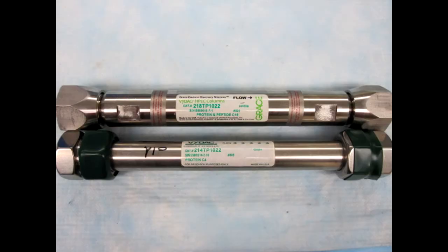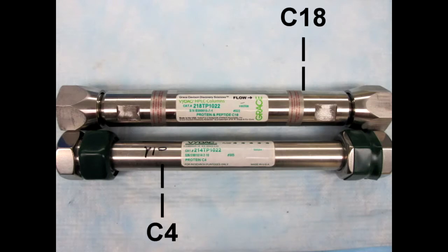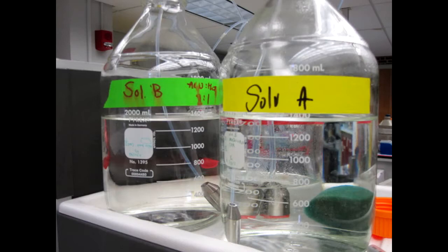For HPLC, our stationary phase includes various hydrophobic C4 and C18 reverse phase columns. We usually use C4 for large proteins and C18 for smaller peptides. For our mobile phase, we utilize the ability to make gradient mixtures of two distinct polar solvents in order to maximize the purification of our peptide.